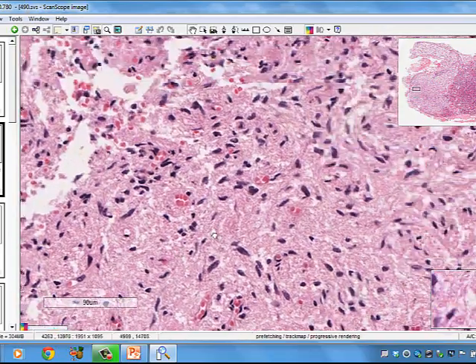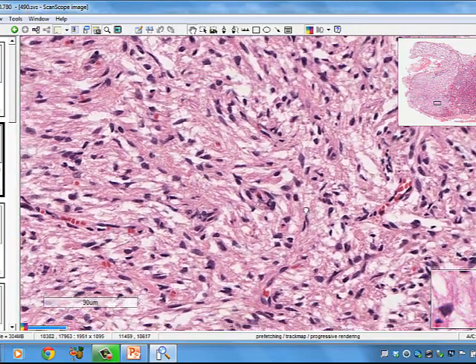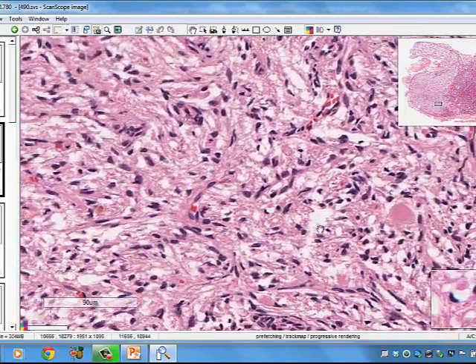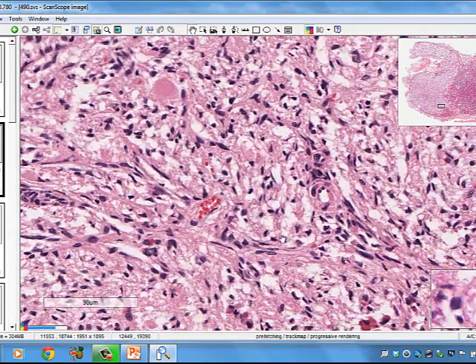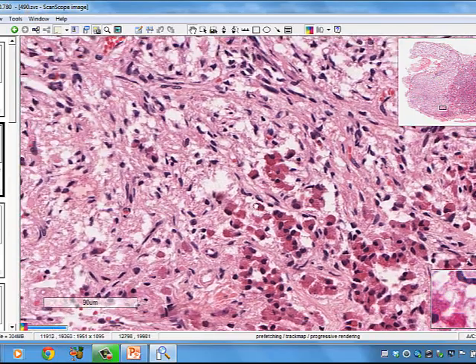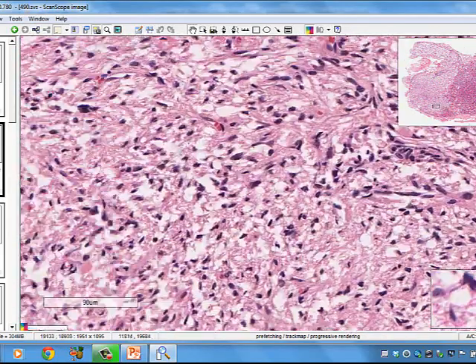I just don't know what they look like in this particular view, but they should be all over. Here's one. Here's a herring body right in through there. See if we can see any more. These are cells. We'll see we're approaching the pars intermedia in through there.